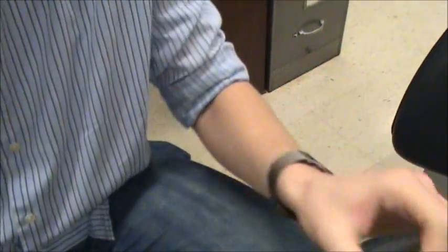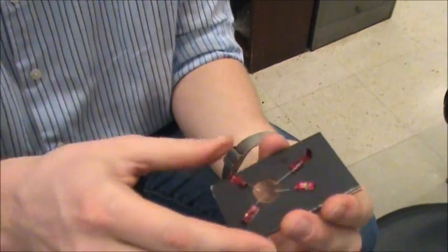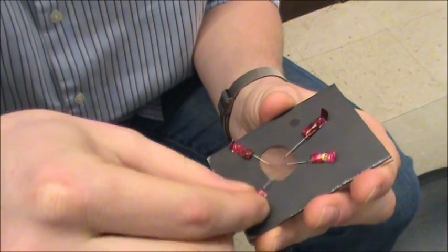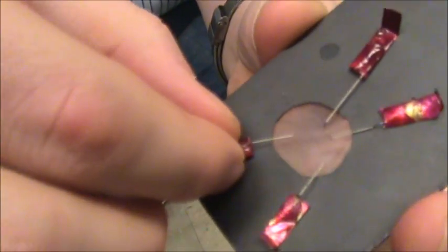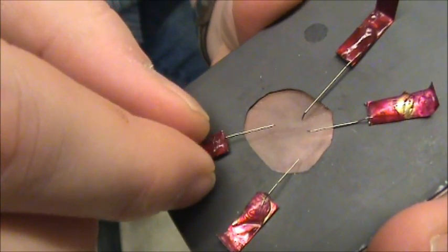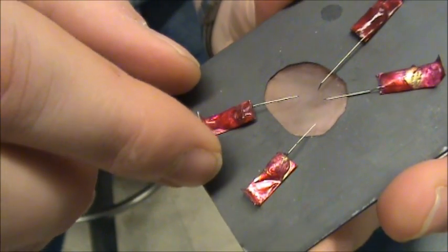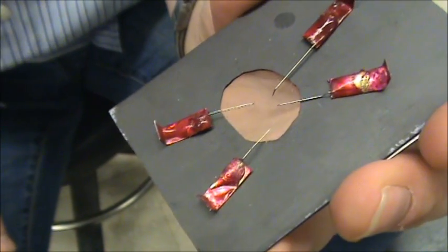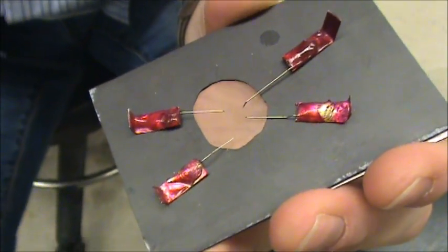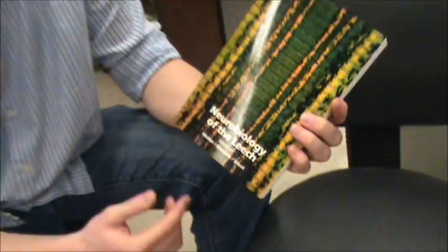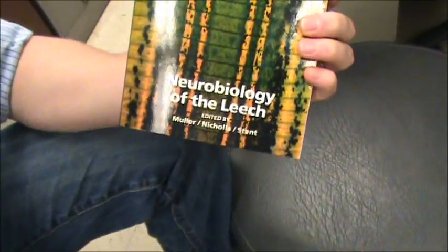When we pin out the leech ganglion we can either use the silgard dish with pins, or we can use these magnetic trays with the sliding pins that were originally designed for leech but the drosophila folks have stolen and not given credit to the leech community. Some of the experts in the leech field have written this book, Neurobiology of the Leech.